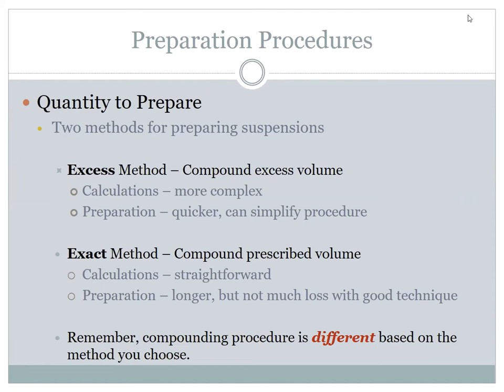And so here's the deal. You'll see here in a minute, the prescription, the way we're going to formulate it is a little more complicated in the calculations. The calculations aren't as straightforward, but when you can figure it out, then the preparation is easy because here's the deal. Remember how the capsules, before you'd have to open some capsules and weigh out the proportion and set up the proportion to calculate how much powder you need because you don't need a full capsule? That's a pain in the butt. We're going to calculate so that we use whole capsules, so I don't have to do all that work. Okay, it makes it much easier to actually prepare the suspension.